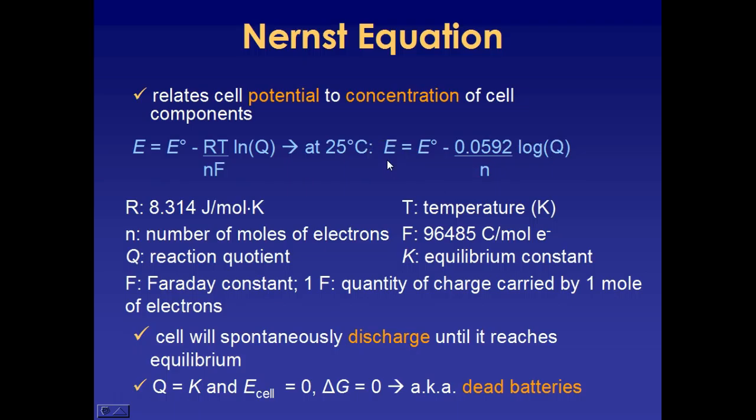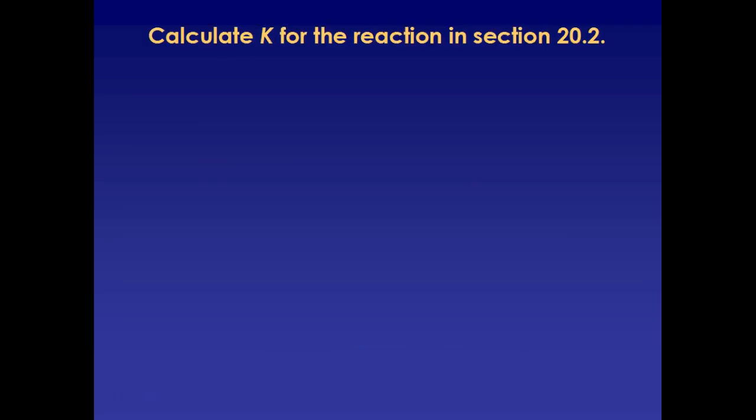So as you diluted your copper concentration, since copper was reduced, the copper ions were a reactant. And according to our Q versus K, if the reactant concentration decreased and we were at equilibrium, we would need to shift towards that reactant concentration to reestablish it, which means our voltage probably should have decreased from that standard amount. And so this is an example of a calculation you would be able to do to finish up part 2 of your lab.